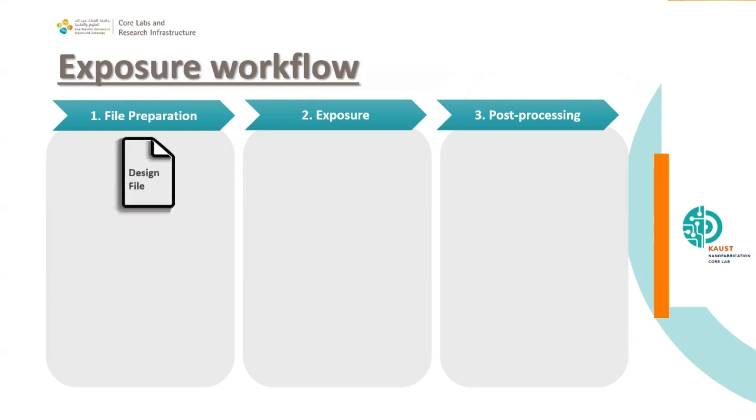Once you have your design file, and I will speak later about the formats you can bring, we will bring it to the same application that we were using before. I think some of you, like the users of the LED 15, will remember.